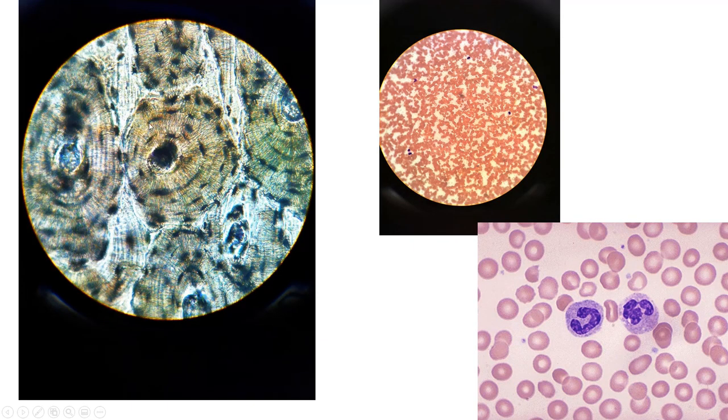This is compact bone. It looks like concentric rings. So compact bone. These are osteocytes lying in spaces called lacunae.